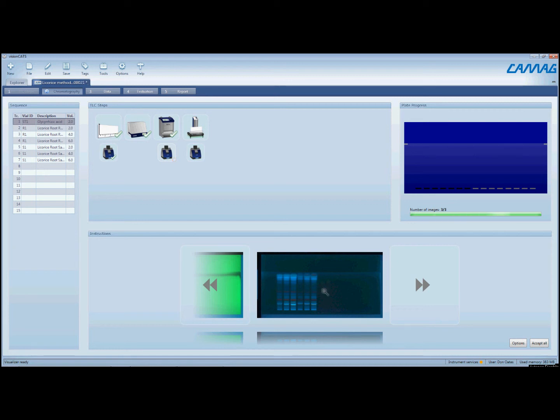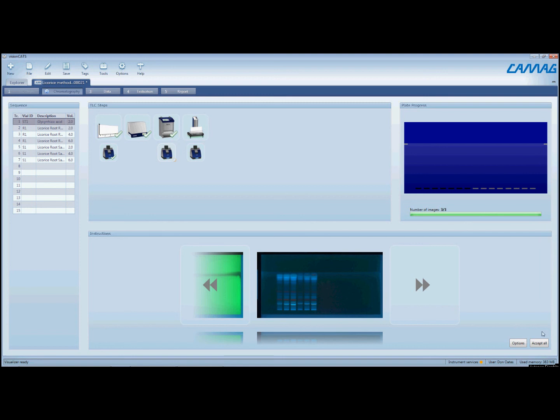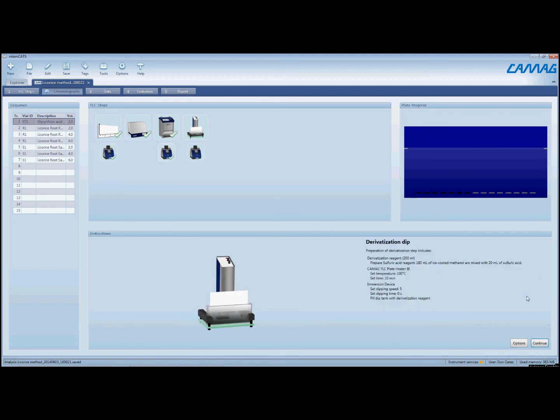And then lastly, we see the 366 nanometer image that we've acquired. And so now if we're happy with these, which I am, we'll click on Accept All. And now it's going to tell us to go to the next step in the process, which is the derivatization.